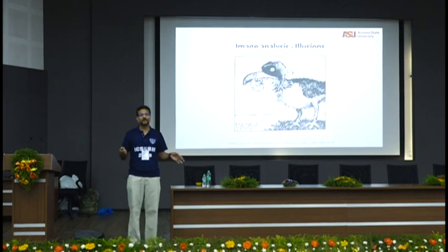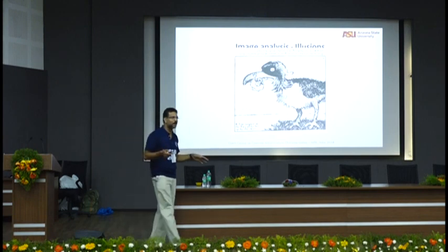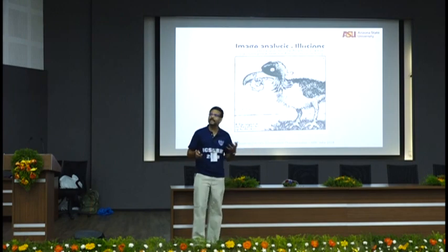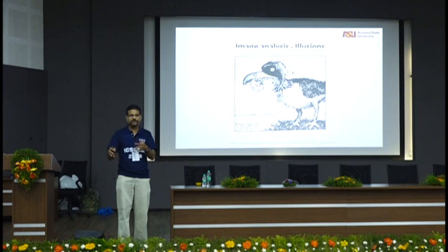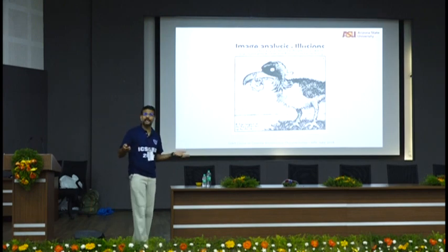This is exactly what you have when you play with images, and that is why you can interpret it whichever way you want. You can think what you've done is right. But that's why you need to really understand what you're looking for. Anybody can interpret. That's why we need to know calcium hydroxide is crystalline and it has a certain shape. Ettringite has a certain shape. CSH is amorphous. Fly ash is spherical. Fly ash can have spheres inside. Those are the facts. You have to merge those facts with what you see in those pictures to create the interpretation of, again, why do we need an SEM picture?